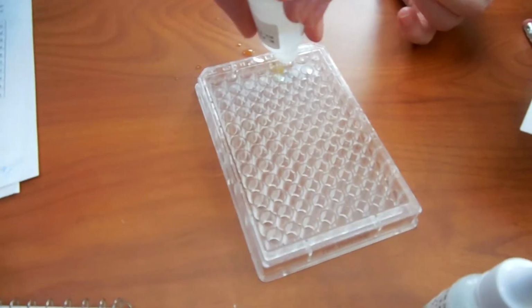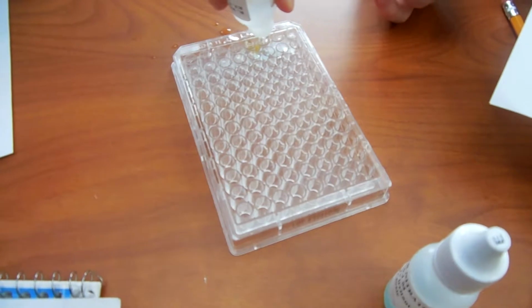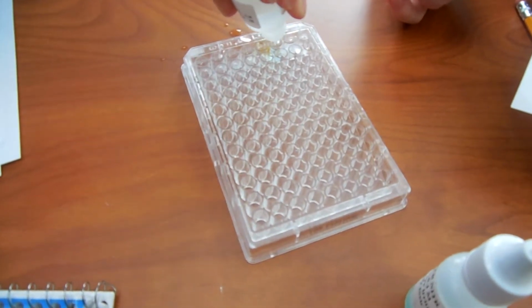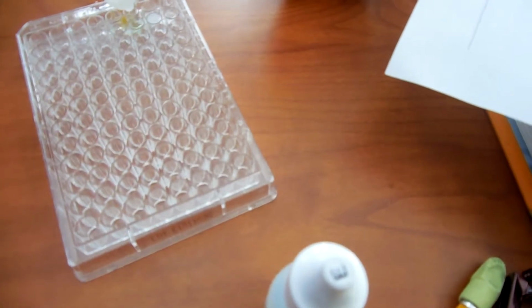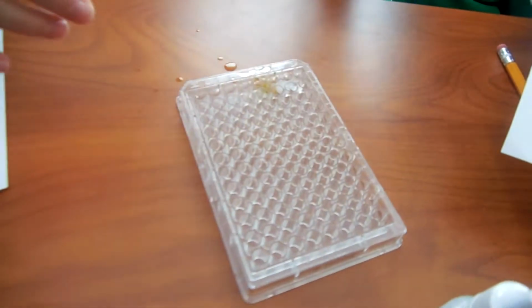What was that? It's potassium iodide, the moderately toxic one. It's not so bad. I don't think you got it on your hands. Should we still wash them? It just splashed on the table.